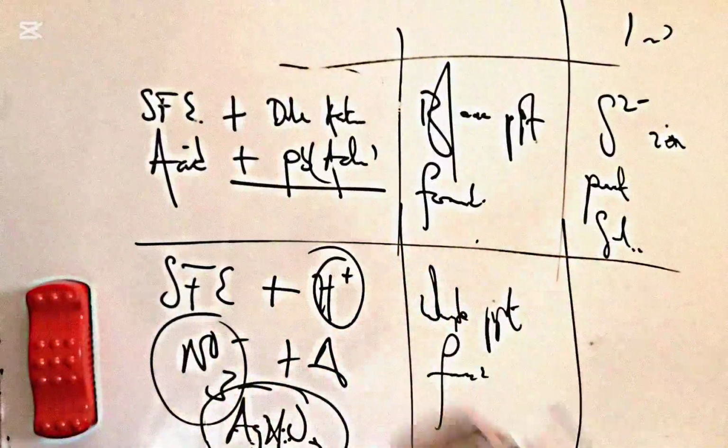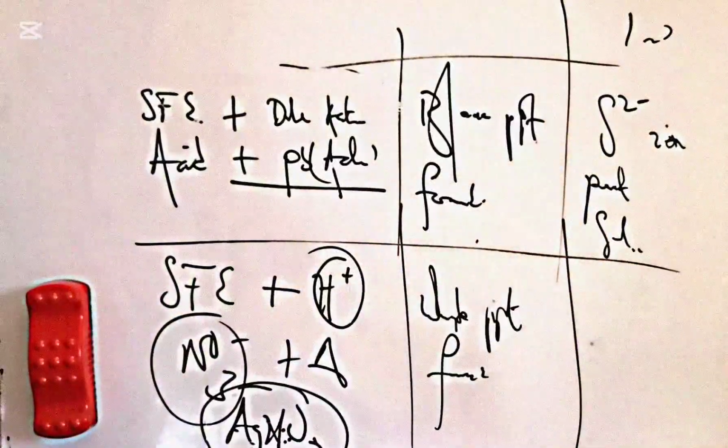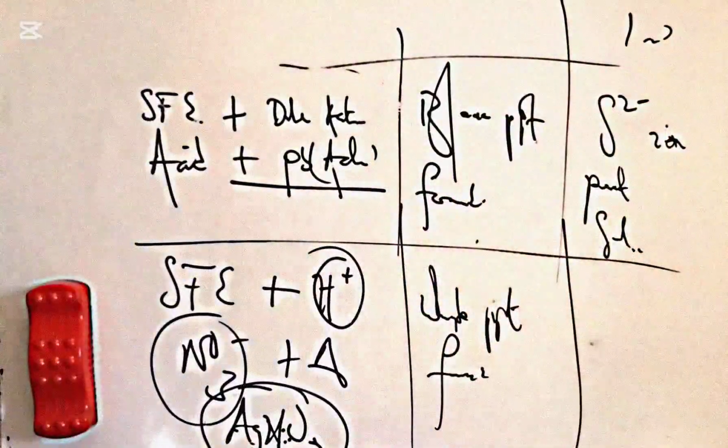All right? That's all. That is your observation. White precipitate was formed. Not writing something else, I'm just seeing all around. Please, you guys should stop making all these mistakes. So, and then what is going to be your inference?